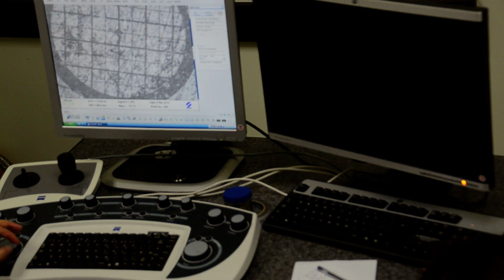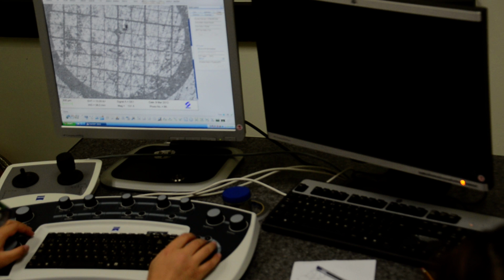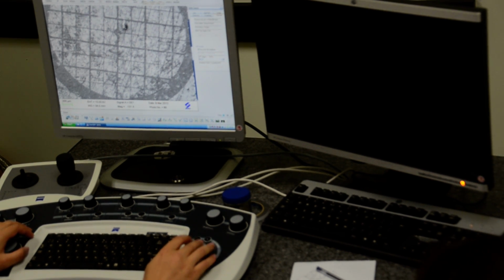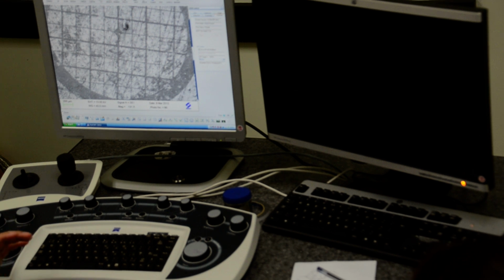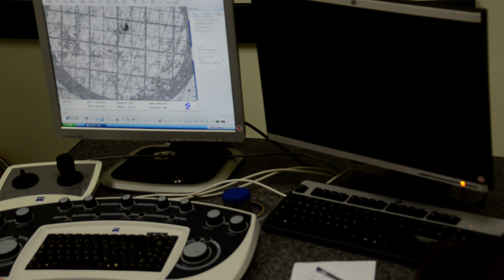So are we provided with all the holders or my file? Yeah. As standard we have two sample holders. But frankly speaking, two is normally enough. Well, no, I mean, if you want a big one, then it's a different story. Yeah. I mean, we're making our own rules.